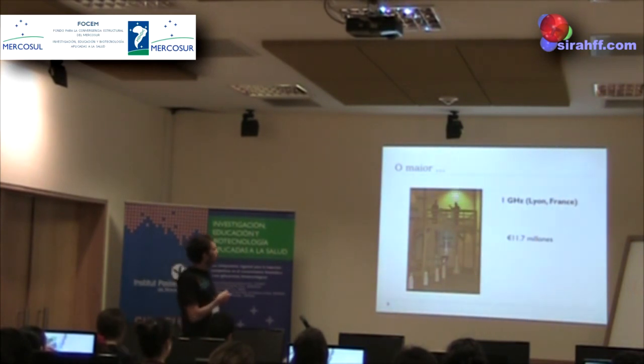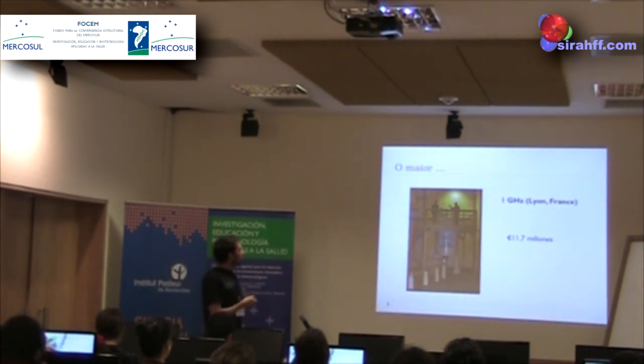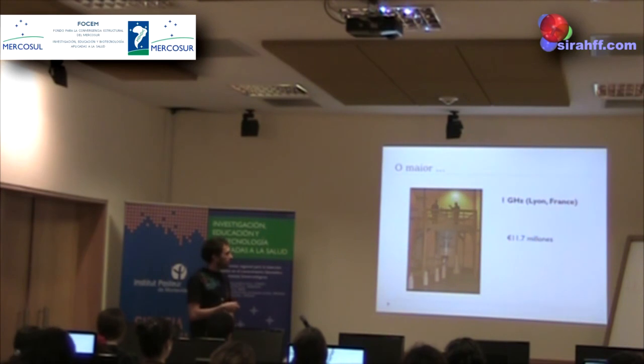The biggest one so far, so I told you we worked in the hundreds of megahertz range. The one we have in Rosario is a 600 megahertz spectrometer. The biggest one that was ever built is 1 gigahertz, a 1000 megahertz spectrometer. It was installed in Lyon, France, and it cost 11.7 million euros, quite a lot of money.